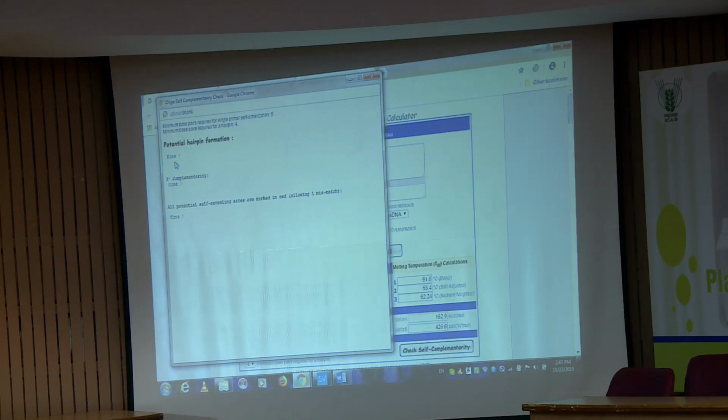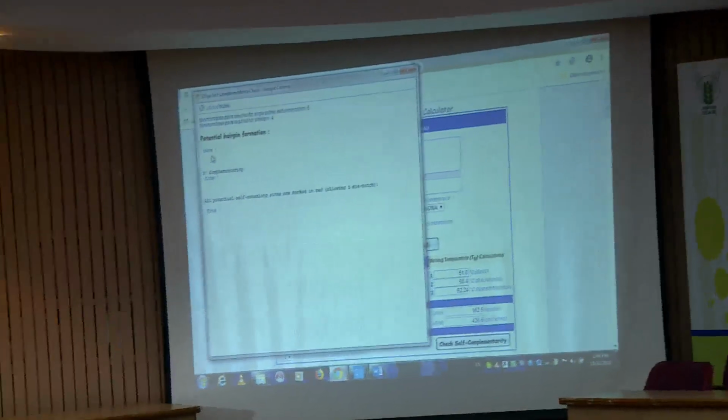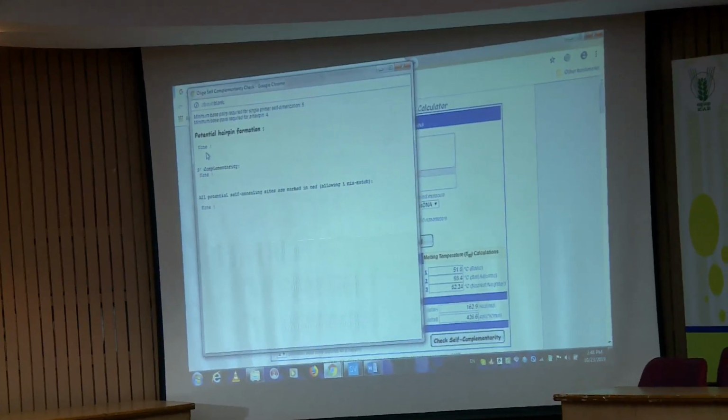The company people will be asking you for labels, so you can label your primer. Let us suppose the gene sequence was DNA2. How can I label it? DNA2-forward, DNA2-reverse. The orientation should be 5' to 3' for both sequences. You send it to the company people who are synthesizing the primers for you.